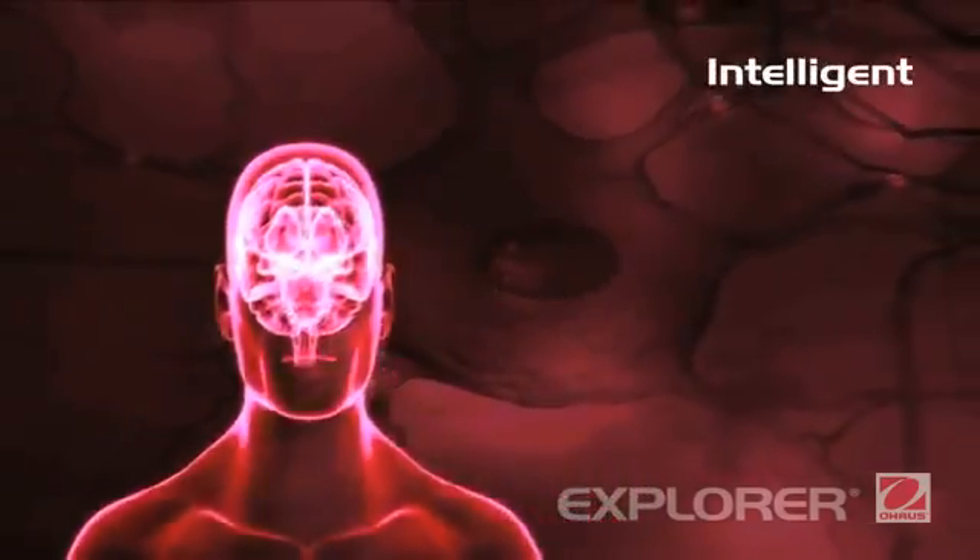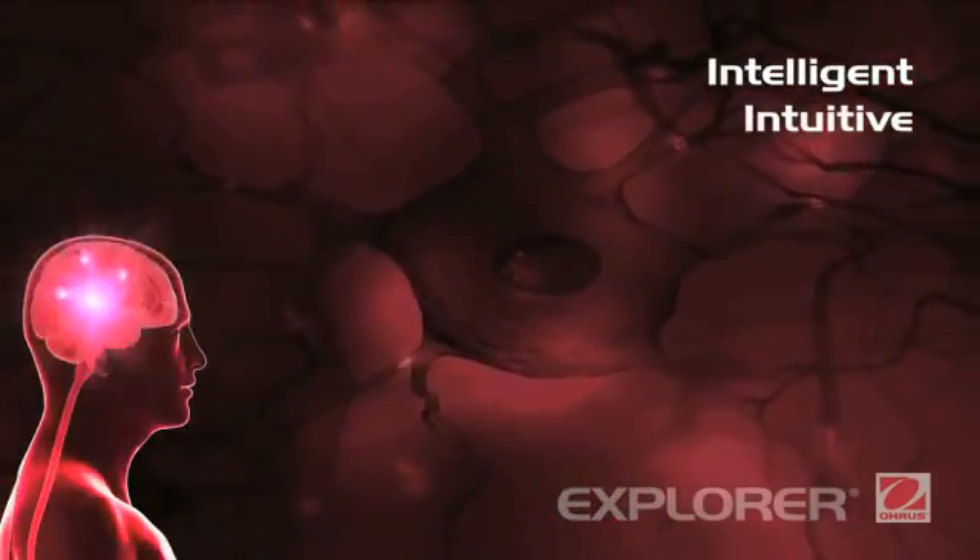The all-new Explorer. Intelligent. Intuitive. Ingeniously practical.